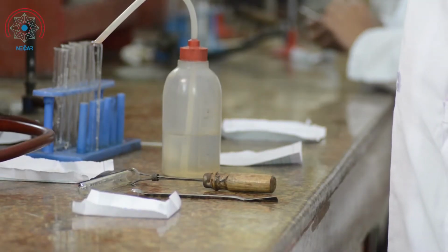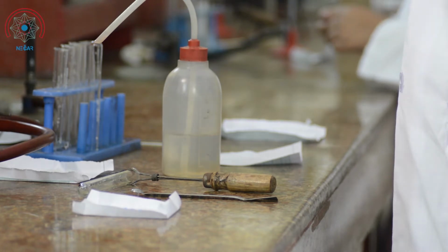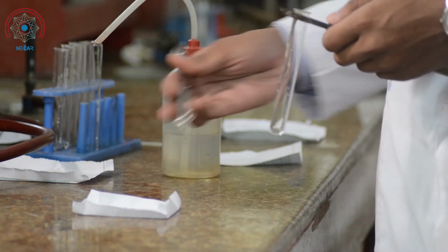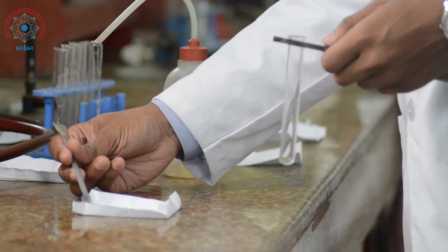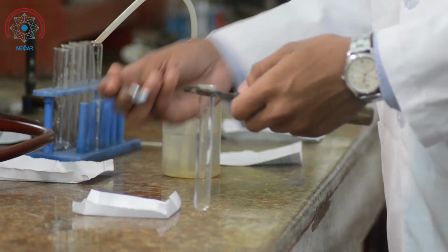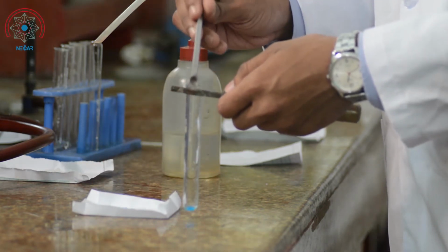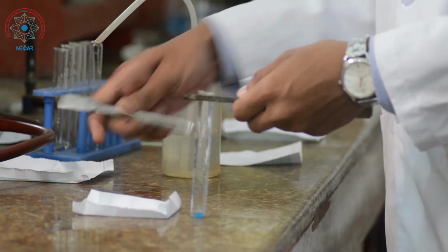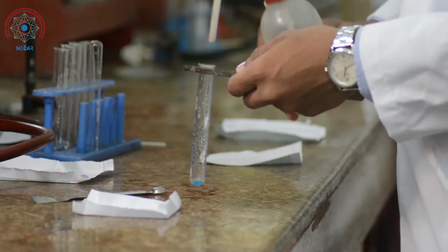Next, we will check the solubility of the salt in different solvents. First, we check in water. For that, we will take a pinch of salt in a test tube, holding the test tube with a test tube holder. Then we will add a bit of water and check it.